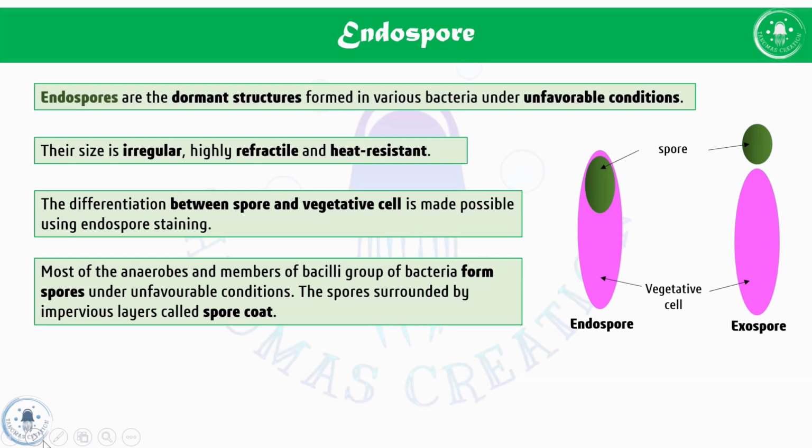The spore coat protects the spore core, which has the important hereditary material like the DNA. We will learn about it in our later slides.